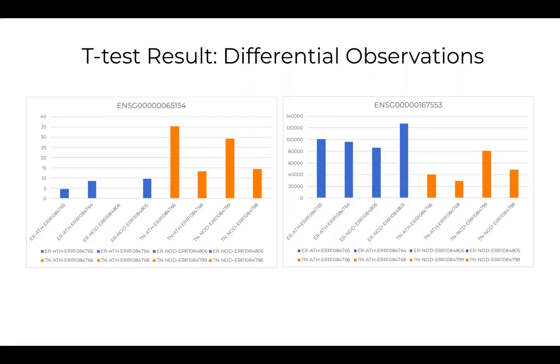So this is a key enzyme in the pathway which converts arginine and ornithine into neurotransmitters such as glutamate and GABA. The y-axis on this bar chart shows the level of expression, where the bar represents an expression profile of a given gene or isoform. So you can see that the bar here is showing the level of expression.